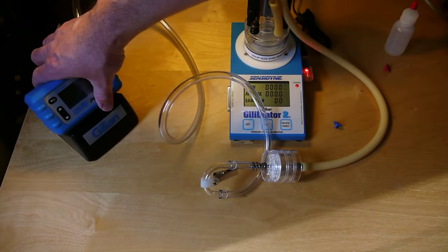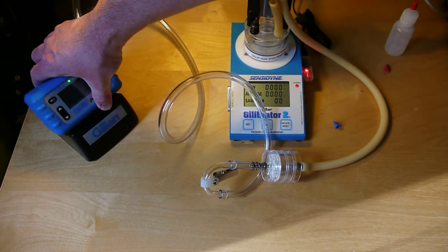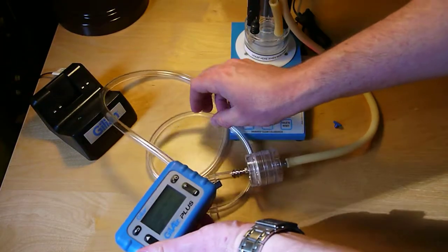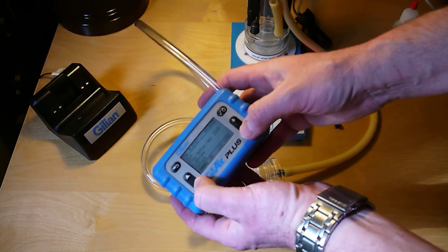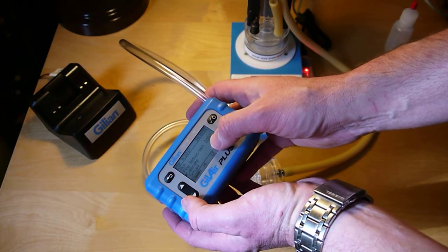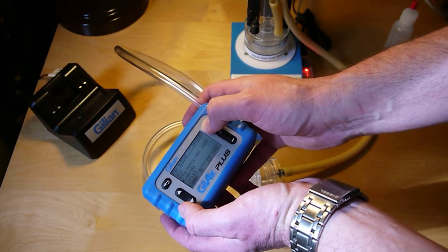I've got this hooked to my Gillair Plus — I've got this one almost fully charged, but before you do a run you should have it fully charged. On the display, I'll go to calibrate. I've got it set for 2,000 cc's per minute. Hit calibrate.